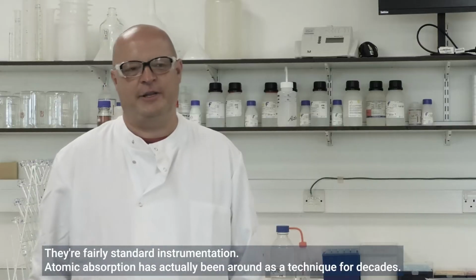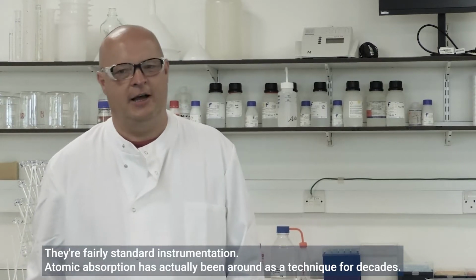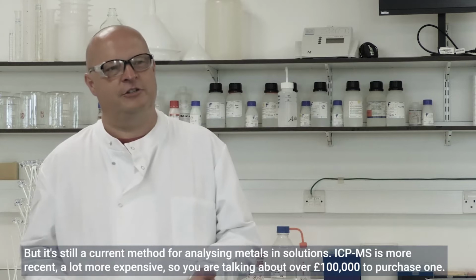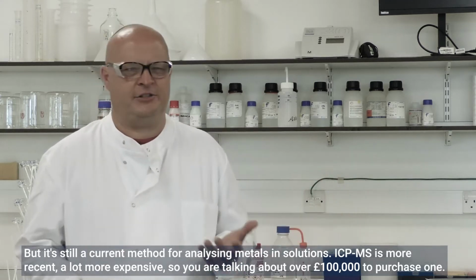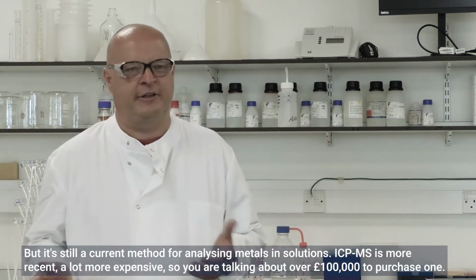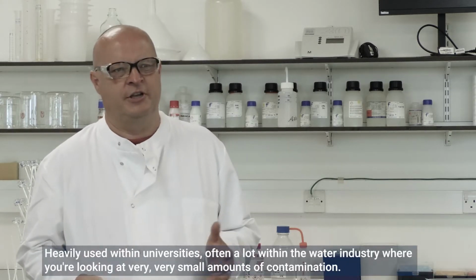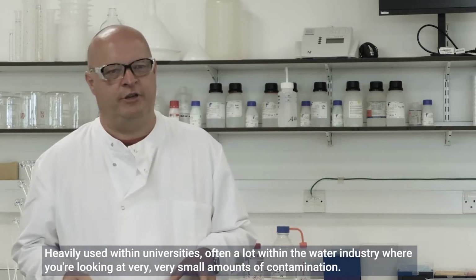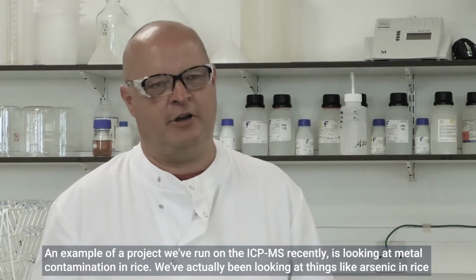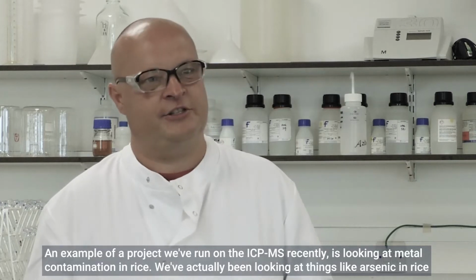They're fairly standard instrumentation. Atomic absorption has been around as a technique for decades, but it's still a current method for analysing metals in solutions. ICP-MS is slightly newer, a lot more expensive, so you're talking over sort of 100,000 to purchase one. Heavily used within universities, often a lot within the water industry, where you're looking at very, very small amounts of contamination. An example project we've run on the ICP recently is looking at metal contamination in rice.